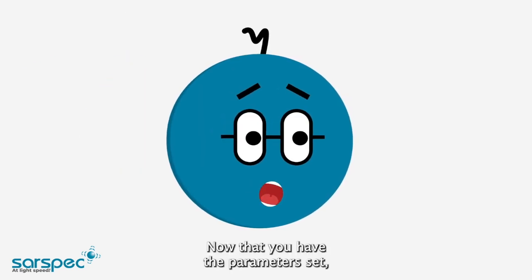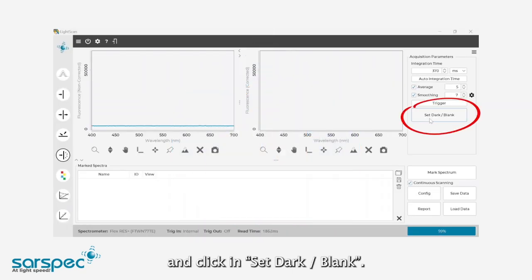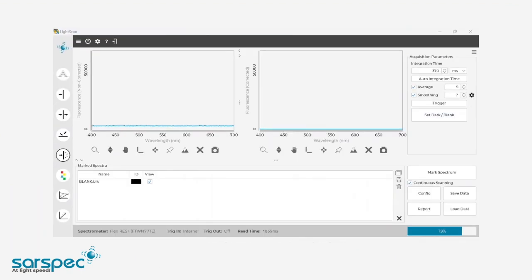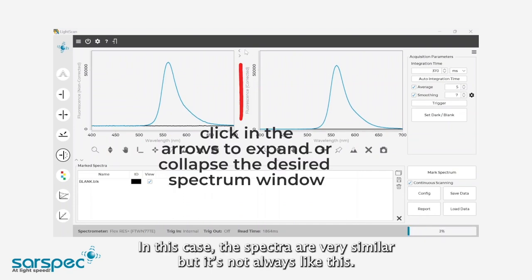Now that you have the parameters set, introduce your blank sample in the holder and click on Set Dark Blank. This step will activate the fluorescence corrected spectra. Put your sample back in the holder and voila! Here is your corrected spectrum. In this case, the spectra are very similar, but it's not always like this.